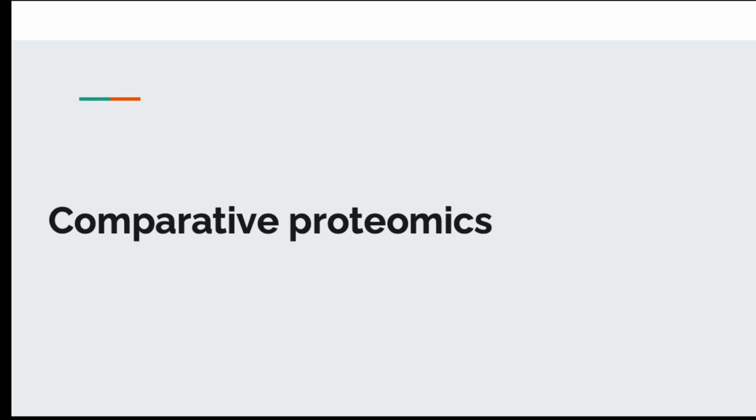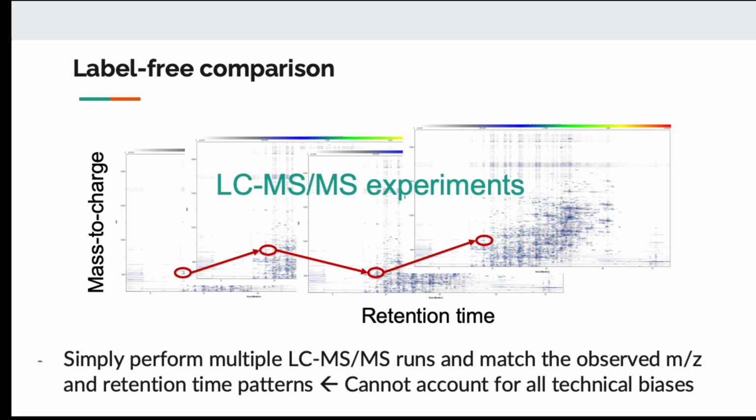Okay. So far, we talked about mass spectrometry on one sample. But when we analyze data, we want to compare effects across samples, like across treatment conditions. We have to be able to compare protein abundance across samples. The problem with mass spectrometry is that the chromatography is very noisy. If you run 2 chromatographies, they are going to look different, even if you put in the entirely same sample, just because of the nature of the flow of the process of separating all the protein and peptide.